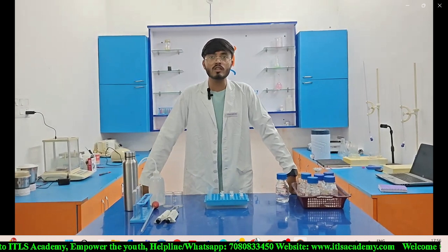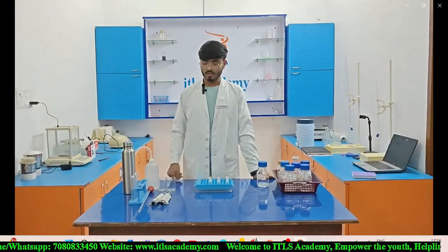Okay, for that these are the materials which we require for performing, like micropipette, reagent. So these are the materials which we require for performing isolation of DNA from human saliva. This is Eppendorf, and this is our Tris-EDTA buffer, which acts as a buffer solution. This is micropipette, and these are test tube holders, and water, obviously, with which we need to rinse.